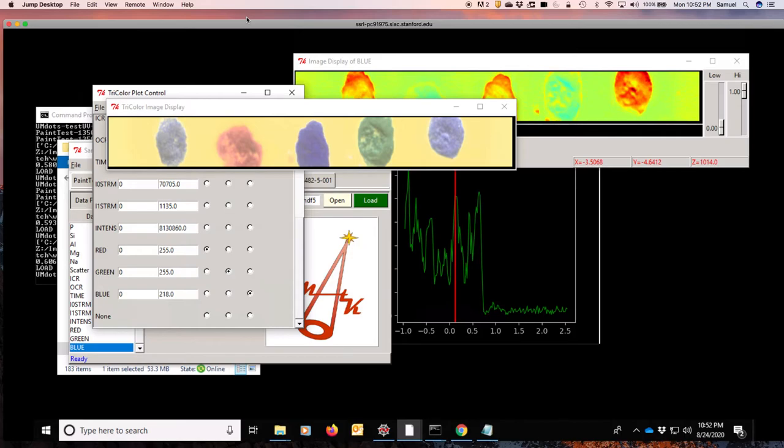This saves you a lot of time, so you don't have to spend those minutes of trying to process the raw spectral data. But if you do want to use a coordinate system like the LAB, you will need to do this manually through the MCA data.